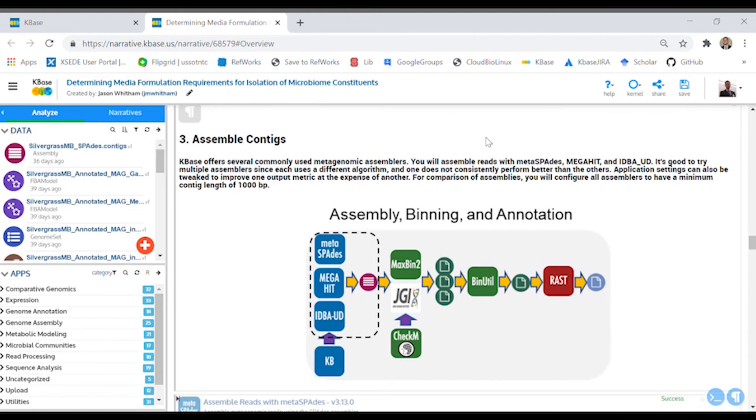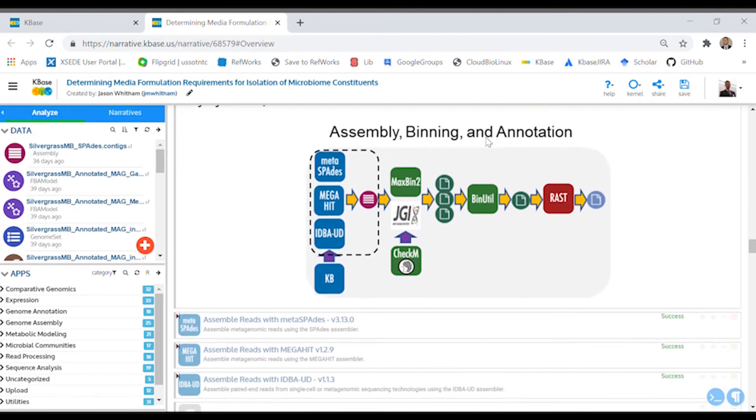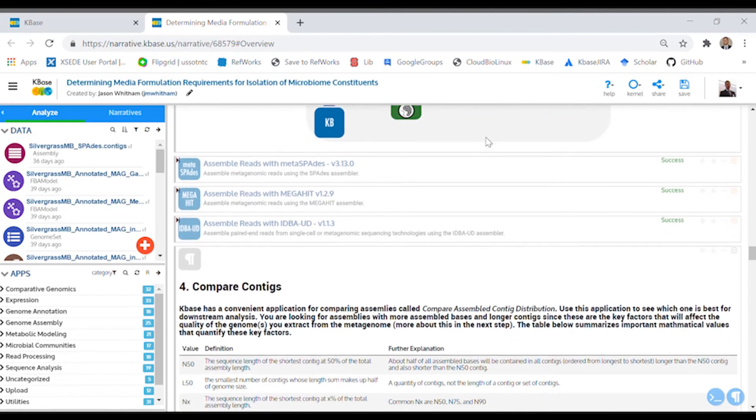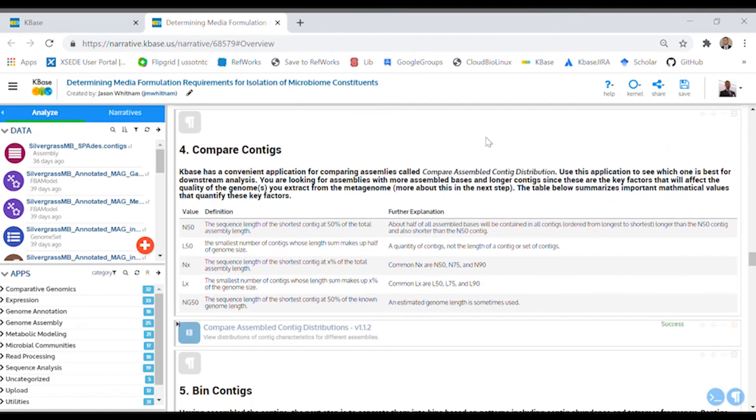Now you're ready to assemble your reads. You won't just use one assembler though. You'll get to try out three that are commonly used in the field.